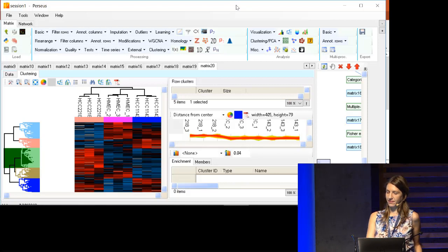When exporting, especially the heat maps, is there a way, if I export it as a PDF, to not lose the whole annotation? Because it only exports what I actually see. So actually, I tried it earlier, and if you zoom in, for example, on a particular region... Only if I zoom in, yes.